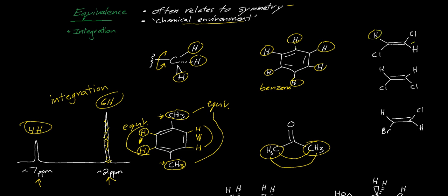these 2 hydrogens, they are the same with respect to each other and everything else throughout. They're equivalent, EQ. These 2 hydrogens are also equivalent. For example, this hydrogen is attached to a carbon here that's attached to a chlorine. Same for this hydrogen here. Both hydrogens are once removed from the other chlorine. Both those hydrogens are equivalent.